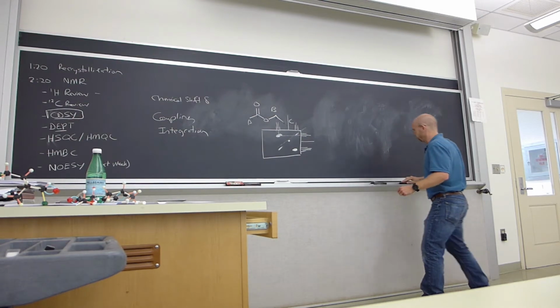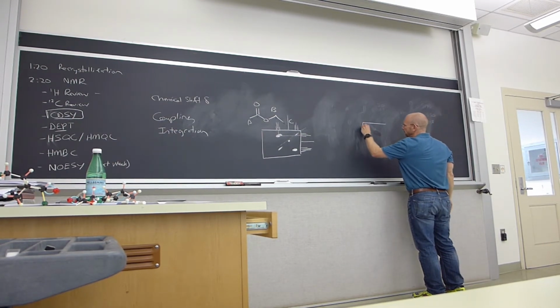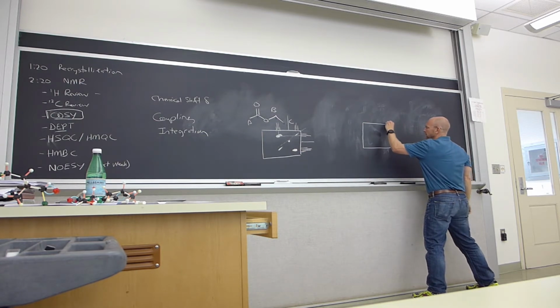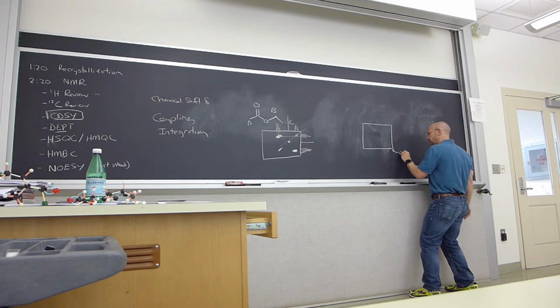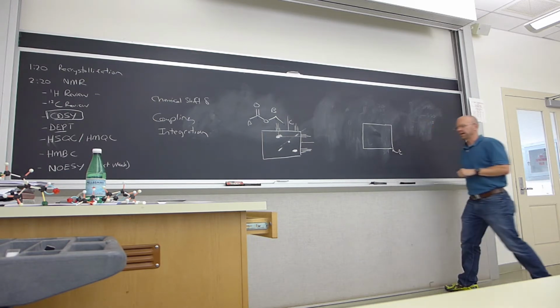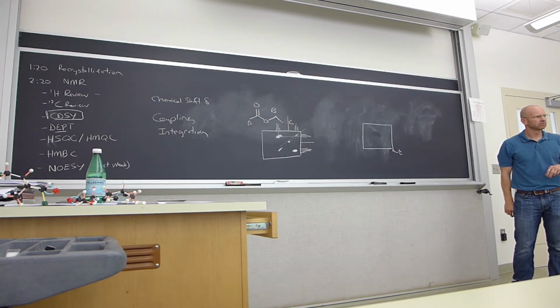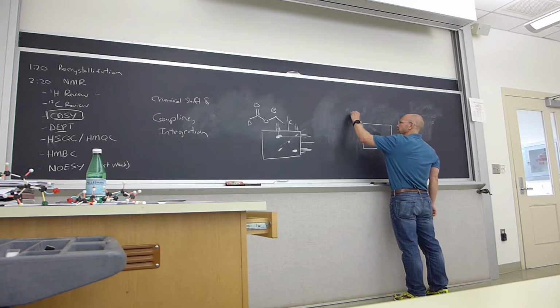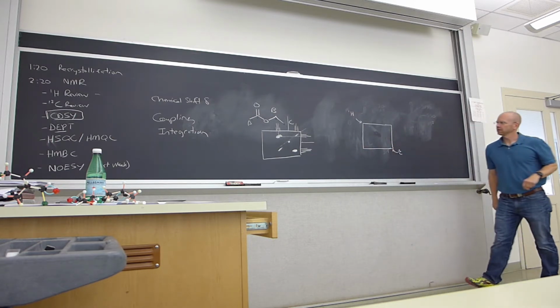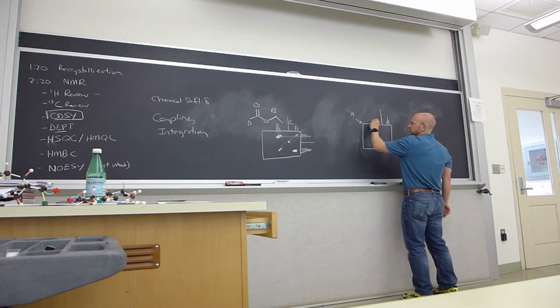I tried to run it, but the experiment failed for some reason. It's easy enough to understand, though. An HSQC or an HMQC is known as a heterocorrelation, a heterocorrelation between a proton and a carbon. So, say for example we're talking about ethyl acetate, we'll just predict what the HSQC would look like.